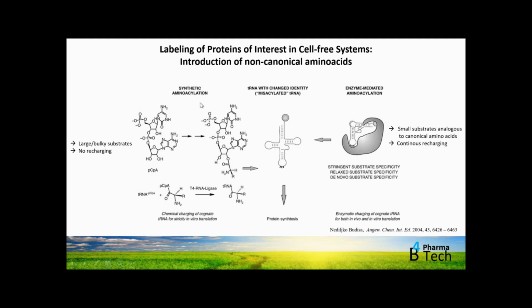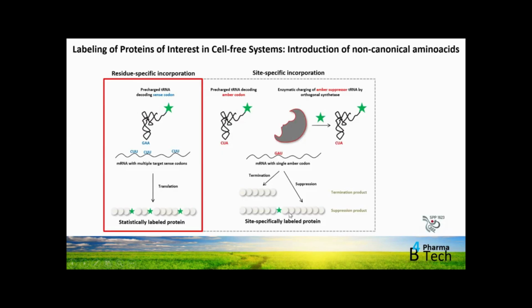We simply have the chemical moiety, 2 nucleotides are added to the chemical moiety, and an RNA ligase then ligates the tRNA minus 2 nucleotides to the chemical moiety plus the 2 nucleotides. So this is a simple RNA ligation step, which was already published a few years ago by Ned Budisha and others. And as a result, after appropriate folding of the tRNA, the pre-charged tRNA can directly be pipetted into the cell-free system for further protein synthesis.